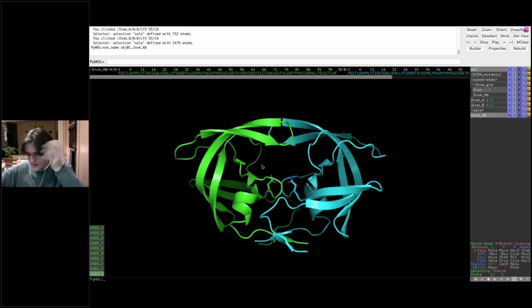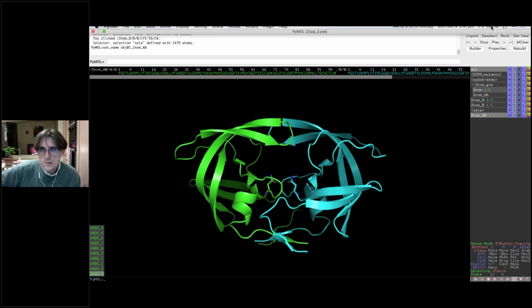Are there any other questions? One question which I feel a lot of us probably struggle with is that sometimes I struggle a lot to get a good view of a protein. The structure may be very crowded to create a figure. Any general tips on things to do?